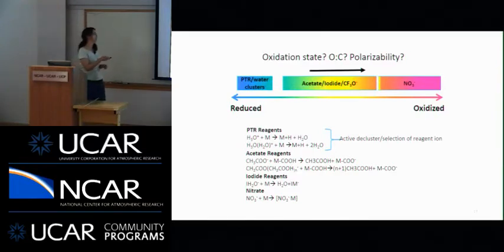And then you have these reagent ions like acetate and I- that we use, and then CF3O- that the Caltech, that the Wennberg group uses. And these seem to access molecules that are sort of intermediate. We can't access the extremely low volatility organic compounds, but we also don't access pure hydrocarbons. So we're sitting somewhere in the middle. So this was the picture that we had.